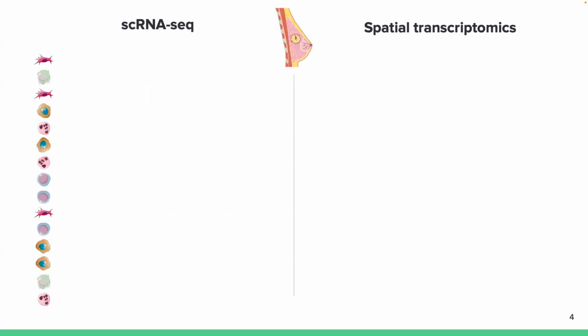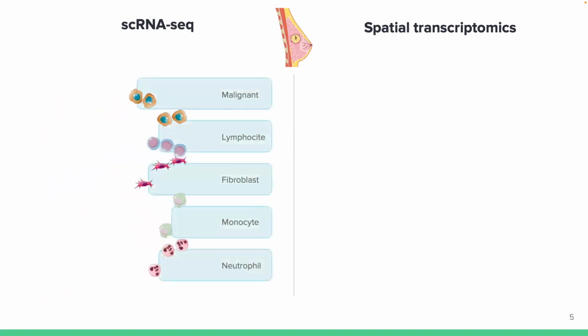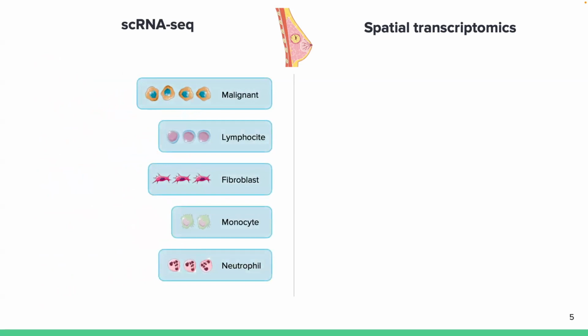In single-cell RNA sequencing, a common step that you have when you get a new data set is to cluster cells. And this allows you to identify, for example, different cell types, or even look at subtypes within the same cell type, and lets you understand what is the proportion of a certain cell type in the tissue and makes you understand what is happening.